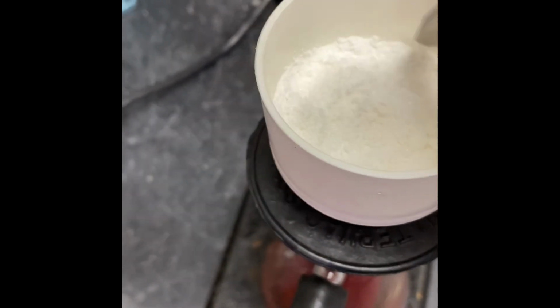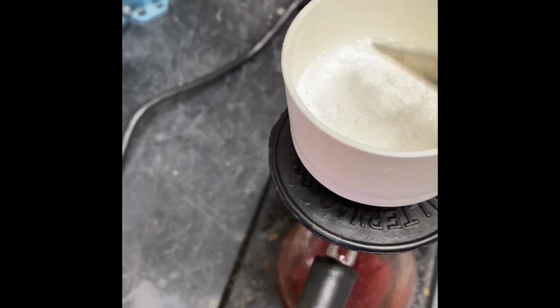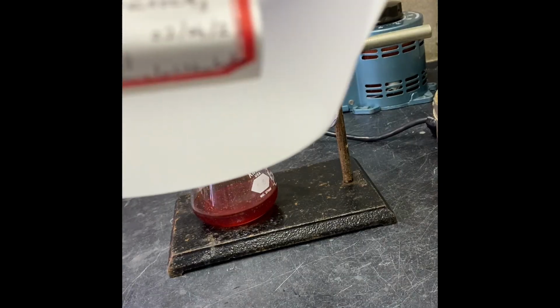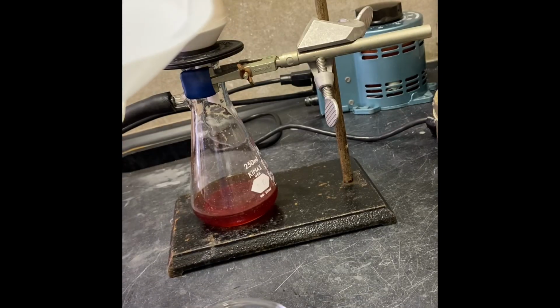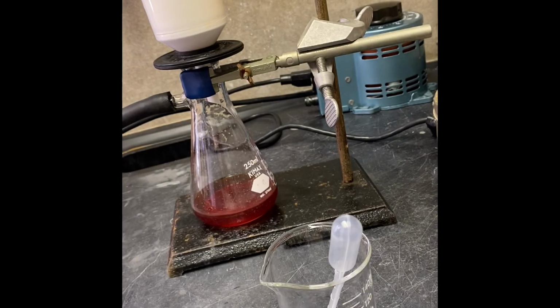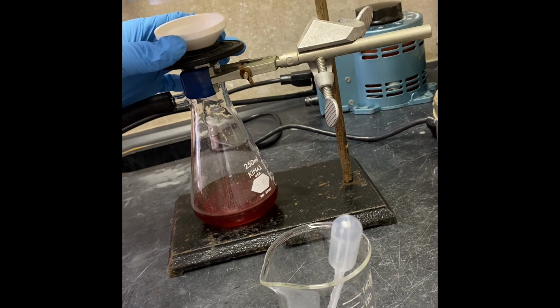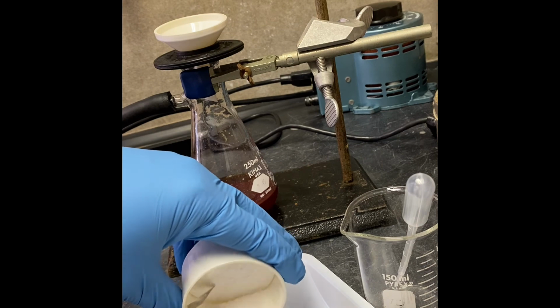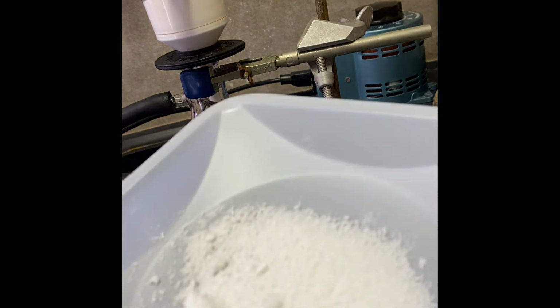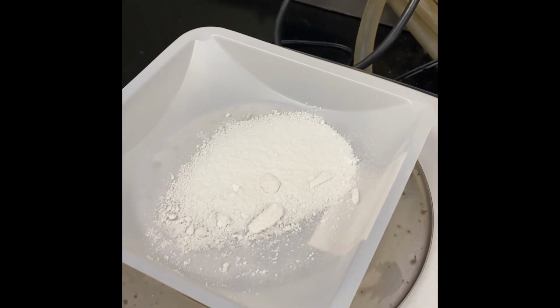Looks like pretty much dry, so we can try to get the weight for it. Let's see how much product we have. We put the label on the weigh boat, and I'm gonna transfer my sample here. I'm gonna get the weight. I pre-weighed that already. That's how it looks like now. That's our product.